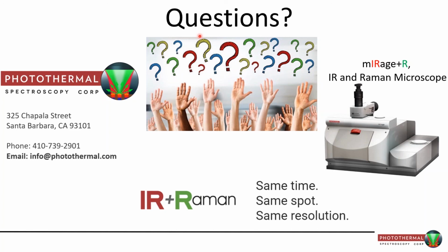I'm sure Mustafa and others have mentioned, you sometimes have to do some small corrections for chip transitions on the QCL laser or things like this. But on the whole, the modes are where they should be. The peak shapes, there can be some small differences, and I'll admit we're still sort of piecing those together. But that's true of any method, I think, where you're going to learn some of the nuance. Overall, the peaks are where they should be, and the ratio between the different peaks, in terms of their intensities, are where they should be. We haven't had anything where we said, wow, this is just a completely different spectrum on the photothermal IR compared to the ATR, which we worried about, but that hasn't been an issue, which we've been pretty excited about.